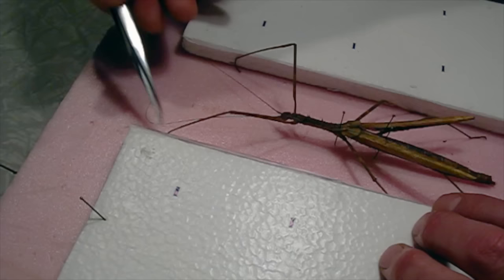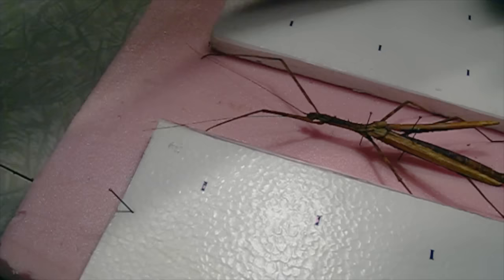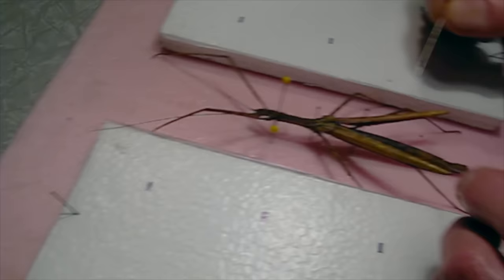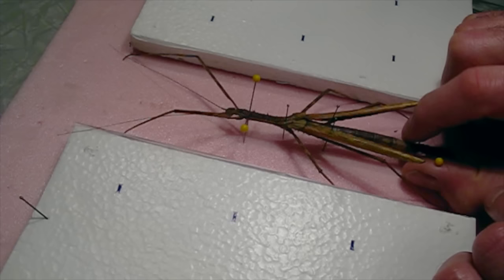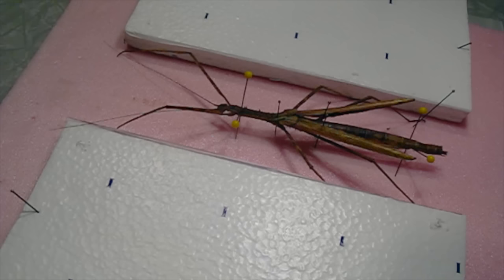The antennae are nice on this too — they're not broken or anything, it's a good specimen. I'm going to put a couple more bracing pins to hold the upper part of the thorax up nice and level, and back here on the abdomen as well. I want it held up. Shape it a little bit, and then pin the legs into position and get them in a good position.